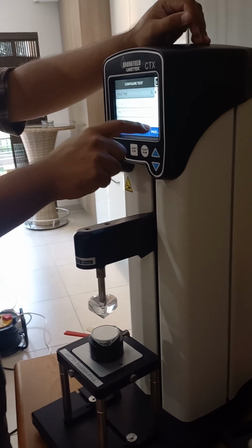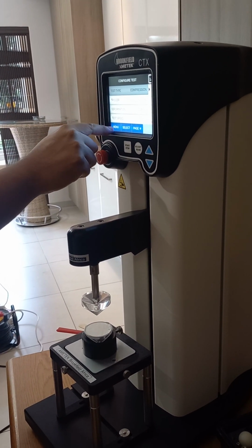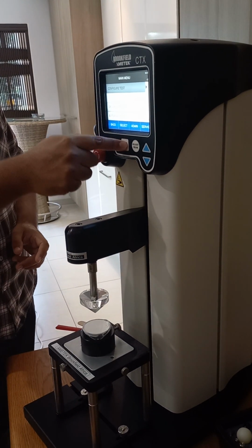Okay, so once we're all set, go back to menu, and then we can press start.